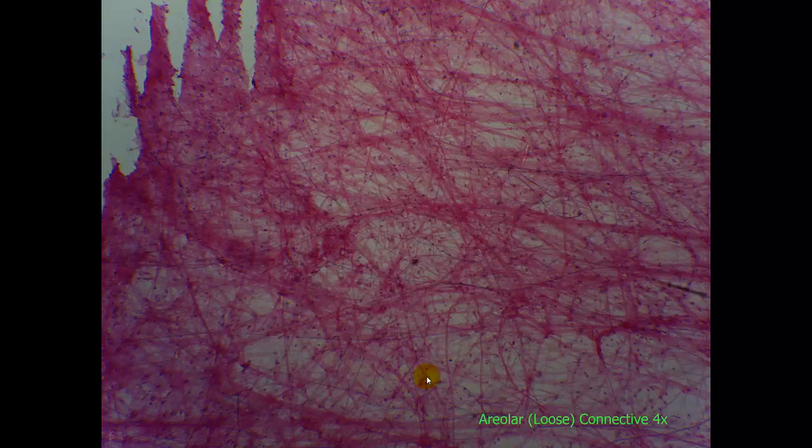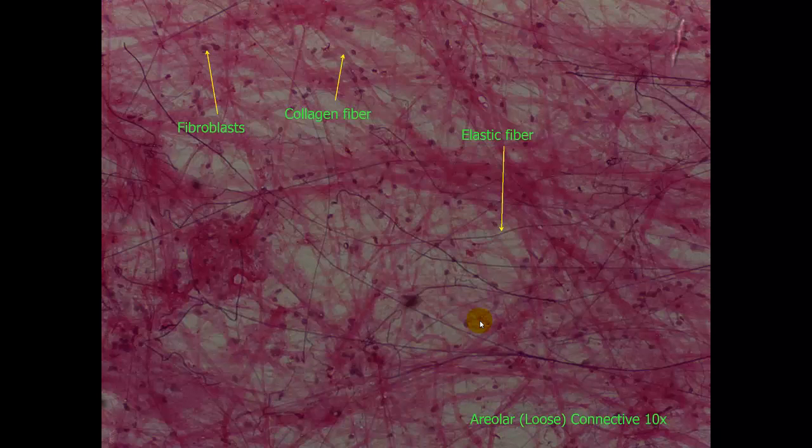Here is areolar or loose connective. This is a very wide open matrix as you can tell. There is a lot of space in there. This is a 4x magnification. This is generally easily distinguishable from the other connective tissues. It has its own very unique look. Let's take a closer look.